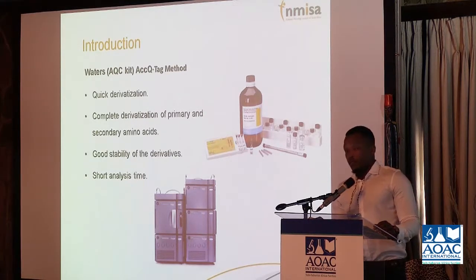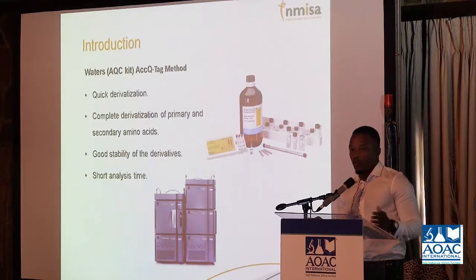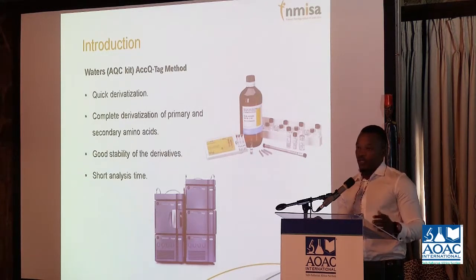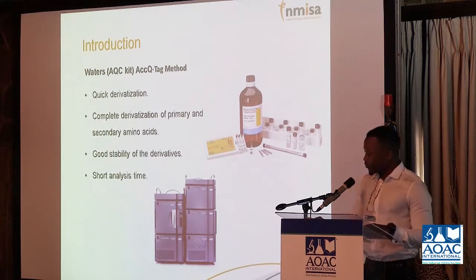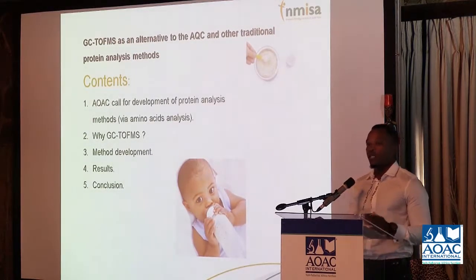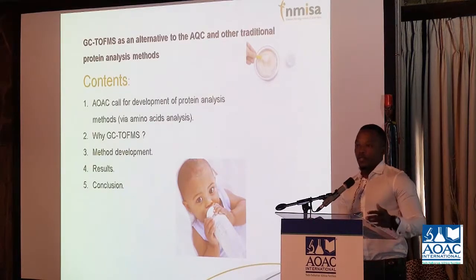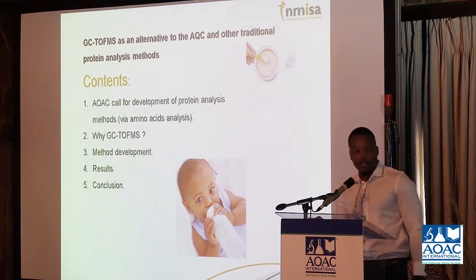However, being in Africa means there are a lot of challenges when it comes to our laboratories. They are not well equipped. Sometimes we might not have an LC to do this analysis on. So we definitely have to find alternative methods to perform this analysis, because it's one of the important analyses that we have to do. This is the reason why we tried to come up with an alternative method that we believe might be a useful alternative if you don't have an LC but you do have a GC or something like that.